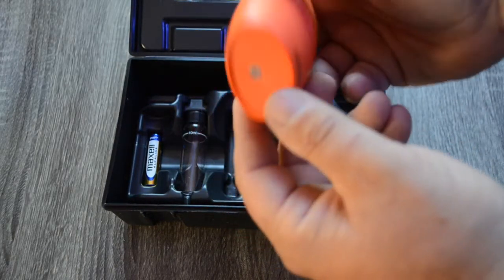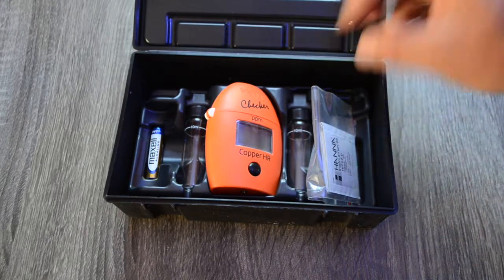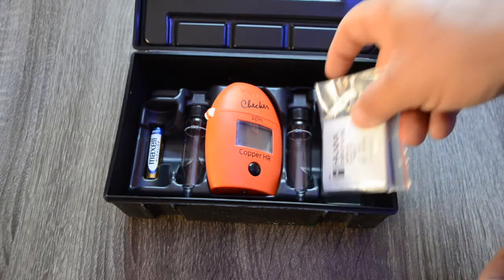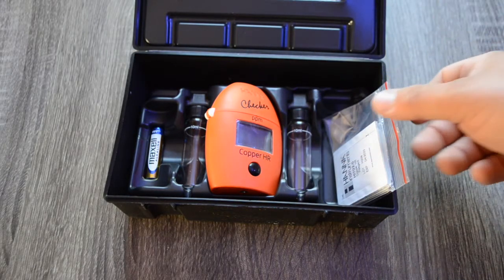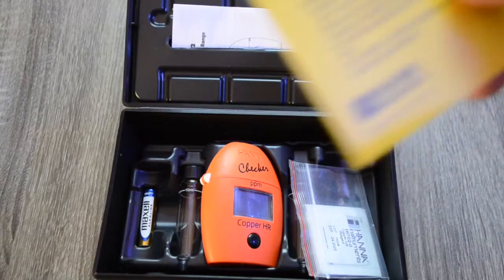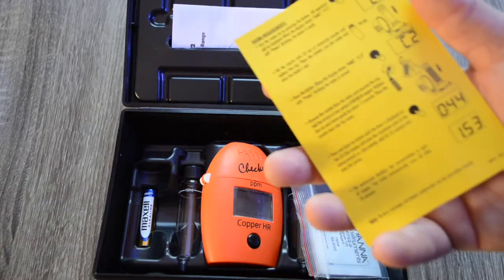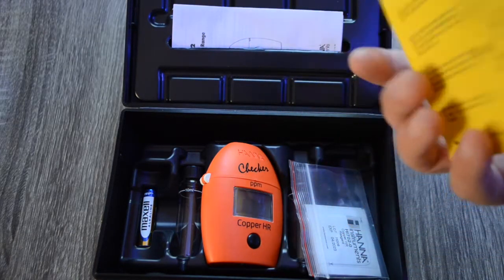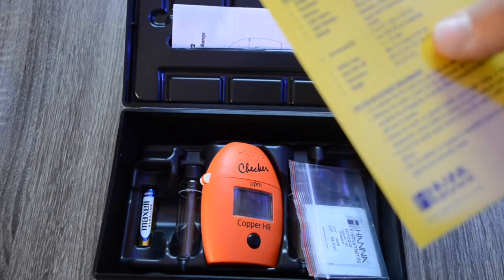You also have the containers in which you do the testing, the Hanna checker itself — it usually has some plastic over the screen — and then you have your battery, which you need to install the first time you use it. The batteries last a pretty long time; I haven't replaced one yet on any of my Hanna checkers. On the quick reference guide you have the instructions for how to actually test your copper, along with some quick technical specs.